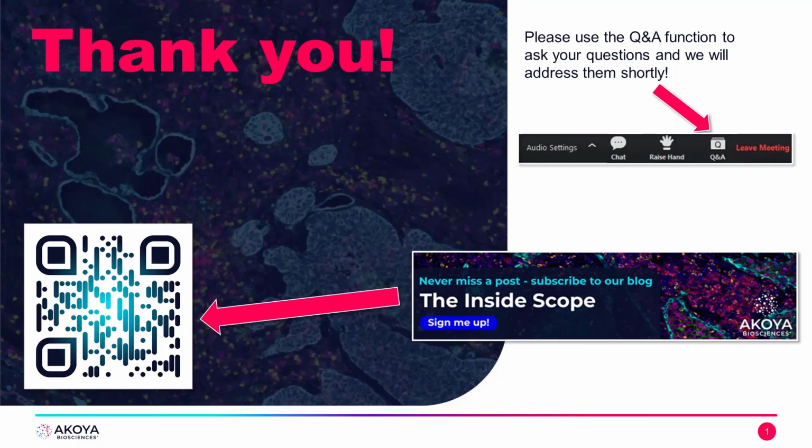How large is the data output of a Codex cycle? That's going to be variable depending on how many markers you're using and how big of a tissue you're imaging. We have data that goes anywhere from a few gigabytes to up to a terabyte, depending on just how much is being imaged at once and how many markers are being used.